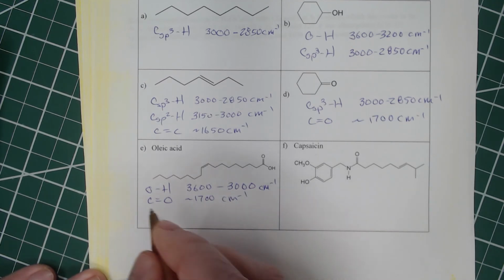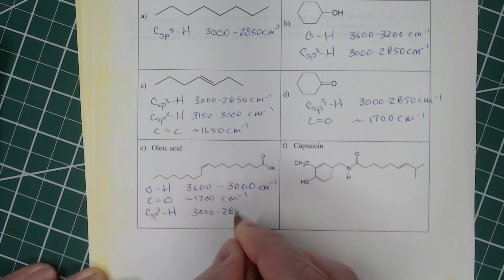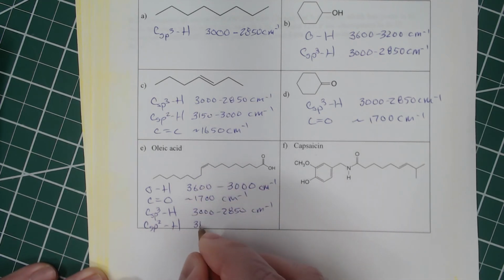All right. We've got carbon sp3 hydrogens. And again, those are 3,000 to 2,850. We've got carbon sp2 hydrogens, right? So right there and there. And those are 3,150 to 3,000.